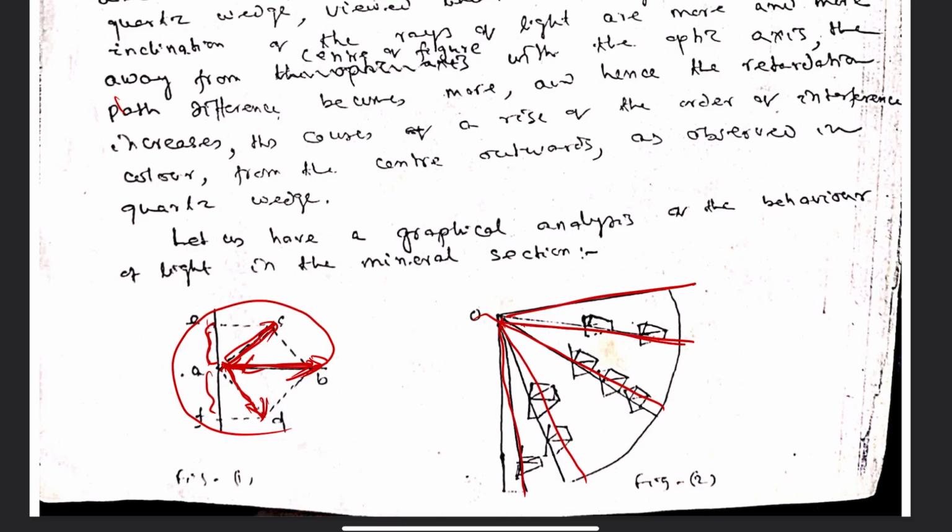The intensity of light in one line is found to be the same. The intensity of light along this is 0, because here light is annihilated, as the two rays which are produced by double refraction are parallel to the polar directions.